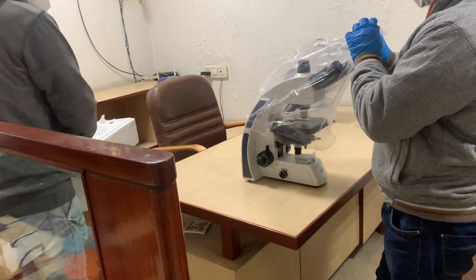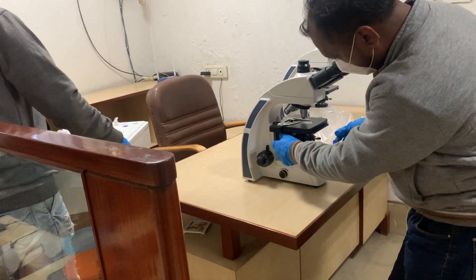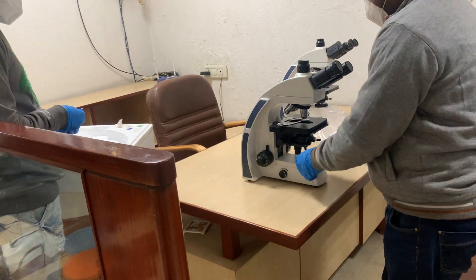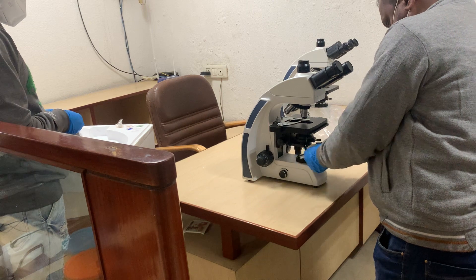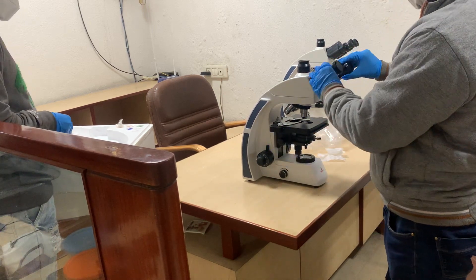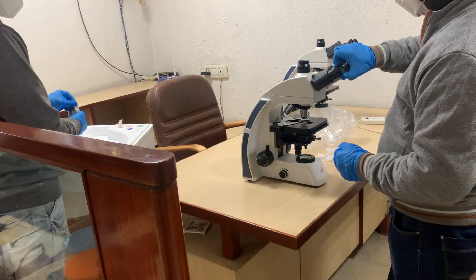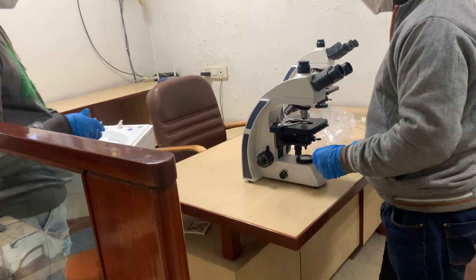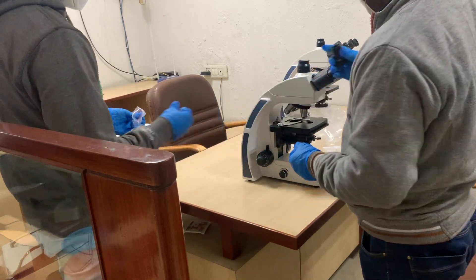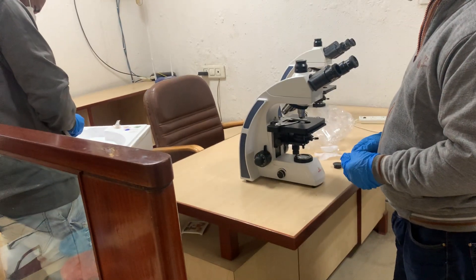The microscope is pre-fitted with all four optics. All you need to do is put the eyepieces in and remove all the butter papers which are used for the safety of the lenses during transit. Remove the dust covers of the head and insert the eyepieces into the eyepiece port of the eyepiece head.